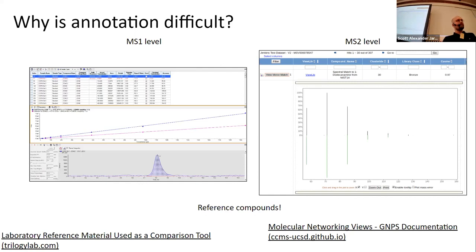So in the MS1 level, if you're looking for products that are readily available, amino acids or fatty acids, you can purchase them from vendors. It's very easy to set up standard profiles, and then you can start screening. But for instance, in the natural products field, unless you isolate enough of your compound, which we typically isolate 1 milligram of quantity, and that's used almost exclusively for biological testing. So you leave no standard reference material at the end. How in the world will you ever set up a standard method to search for your compounds?